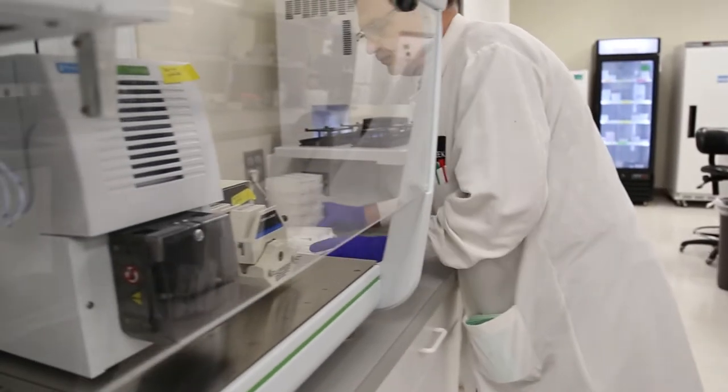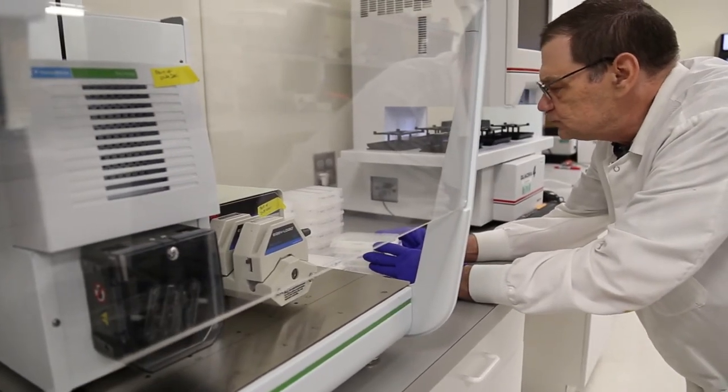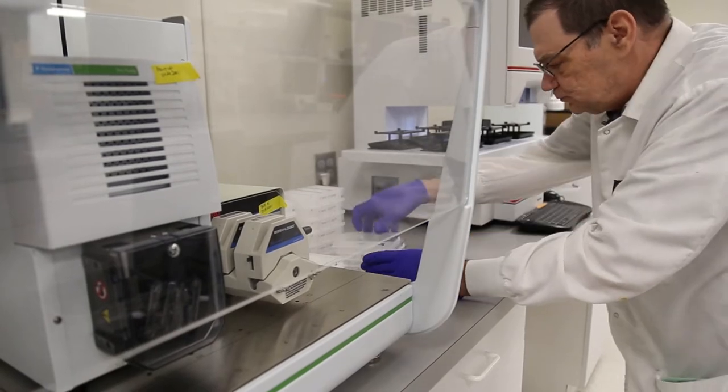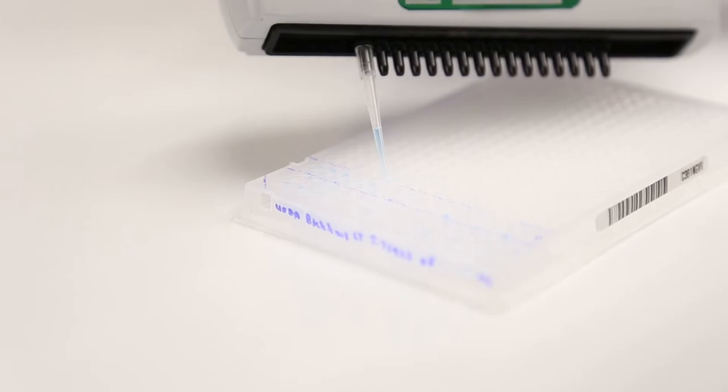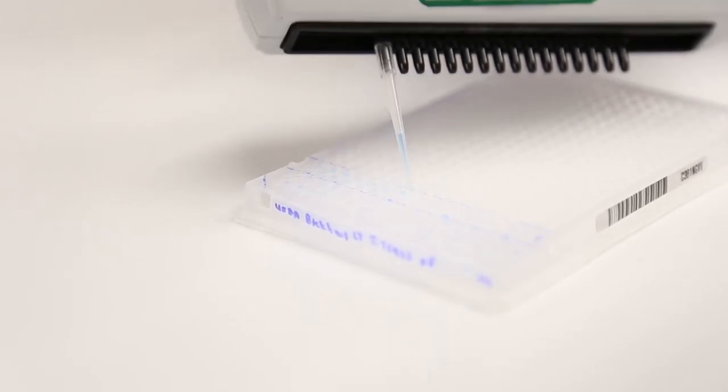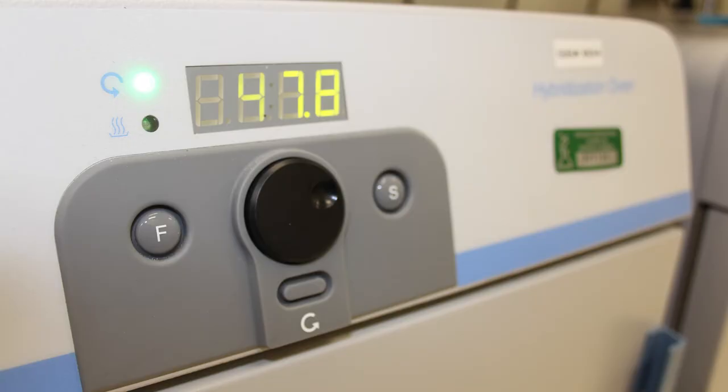The final lab steps are setting up the samples to run on advanced instruments that detect specific DNA markers and read targeted sequences of genetic code. First, we take the minute quantity of DNA obtained through DNA extraction and amplify it. This amplification process makes thousands of copies of the DNA.